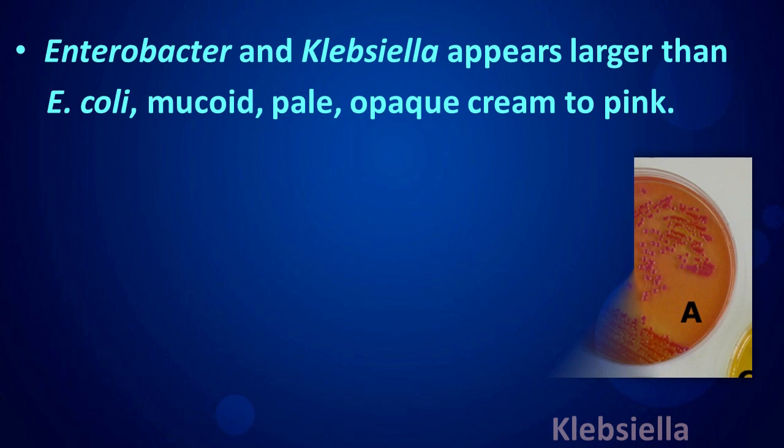Enterobacter and Klebsiella appear larger than E. coli — mucoid, pale opaque, cream to pink.